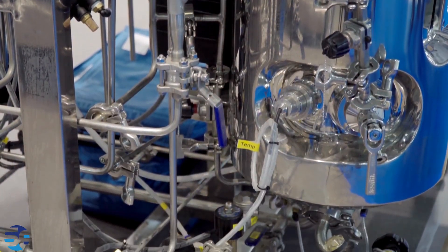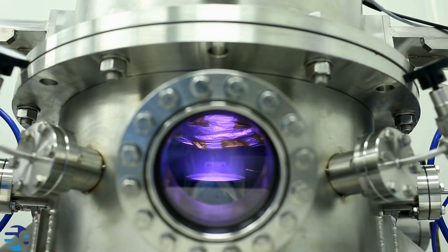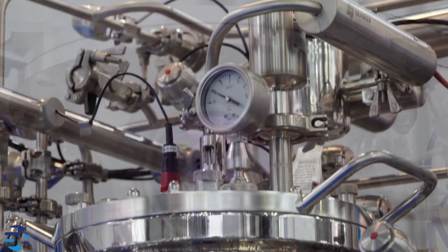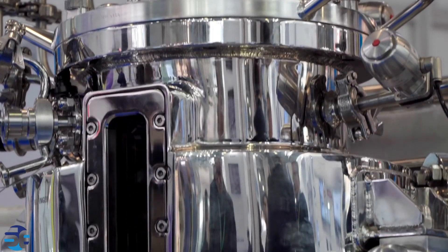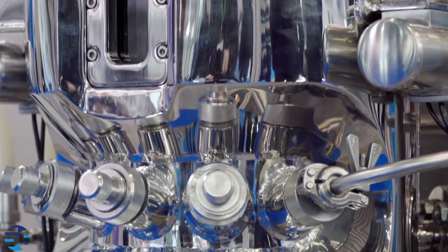Autoclave reactors find applications in various fields such as chemical synthesis, polymerization, hydrothermal synthesis, and material science. They are particularly useful for reactions that require high pressures and temperatures to achieve specific results, and they provide a controlled environment for conducting experiments safely and efficiently.